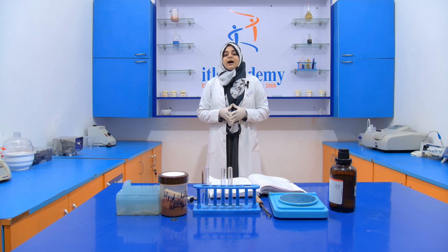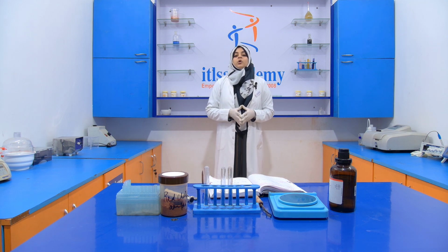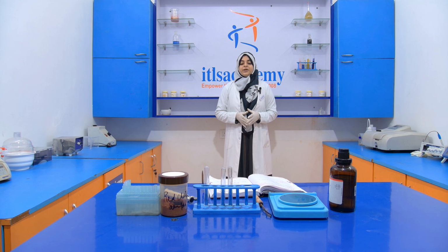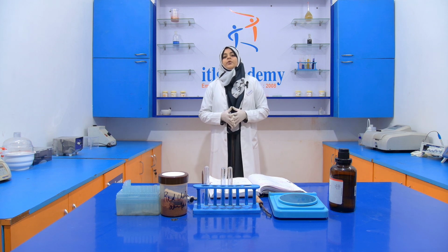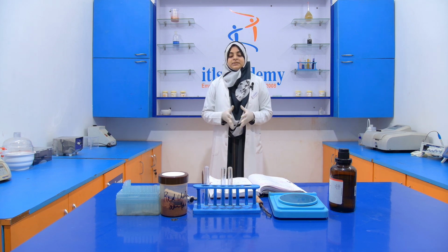But when adulteration occurs, the quality of that food product decreases and the nutritional value of the food product also decreases.